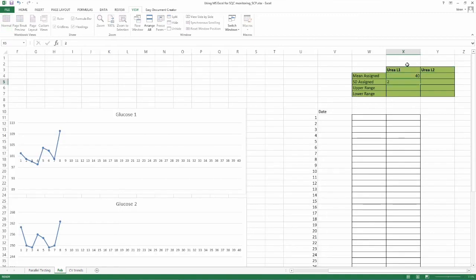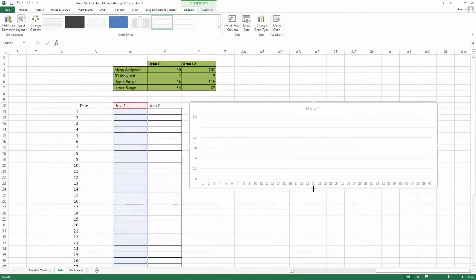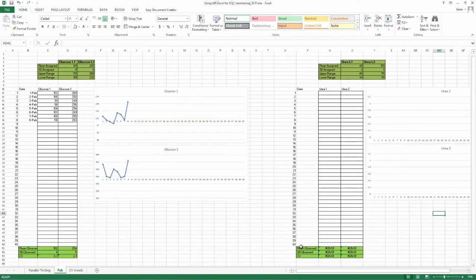Inserting assigned data referring to urea 1 and 2. The formulae will be present in the copy-pasted version. However, graphs will have to be constructed as instructed earlier. The Excel sheet is very broad and will lend itself to including data of several parameters thus.